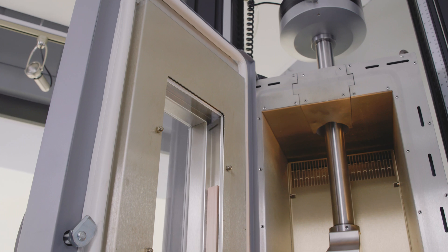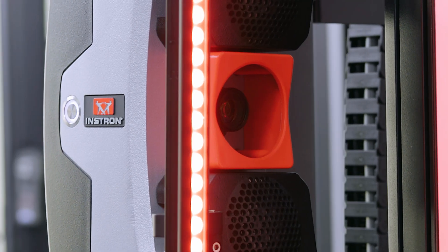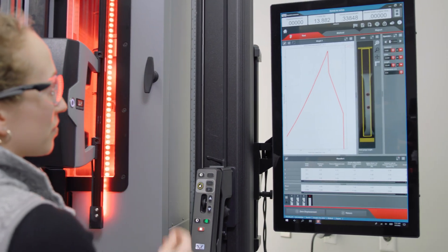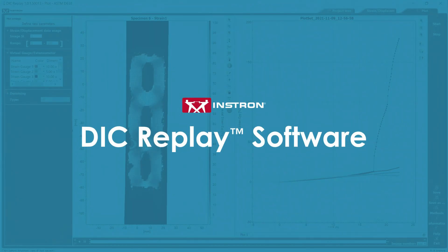All Instron chambers have a heated optical quality glass window to minimize frosting and misting when testing at low temperatures. This allows the use of our AVE2 video extensometer for strain measurement through specimen failure. The AVE2 records images of the test which can be used for synchronized playback or post analysis using digital image correlation software. We recommend the AVE2 with a chamber because of its ease of use, its ability to be used through break on all types of materials including high elongation materials, and since it sits outside the chamber, it has higher temperature limits.